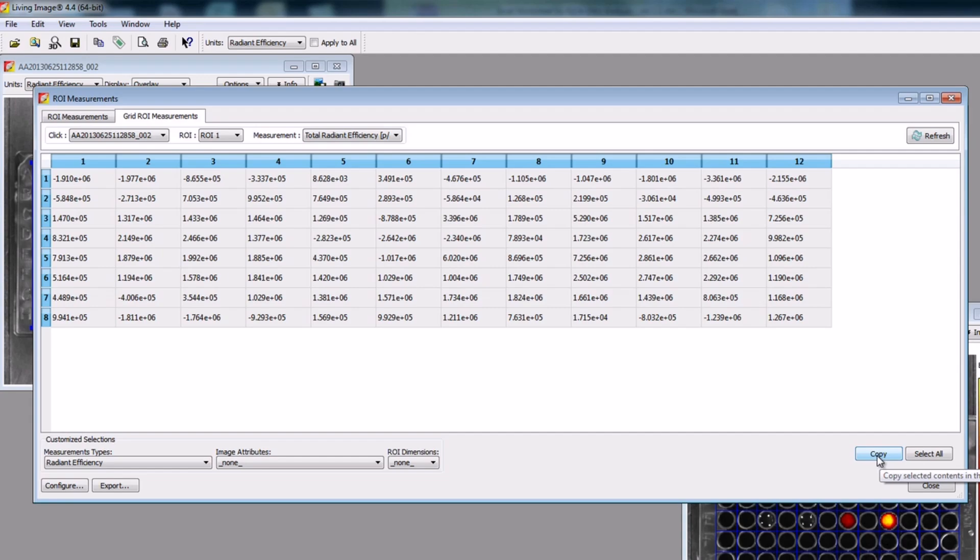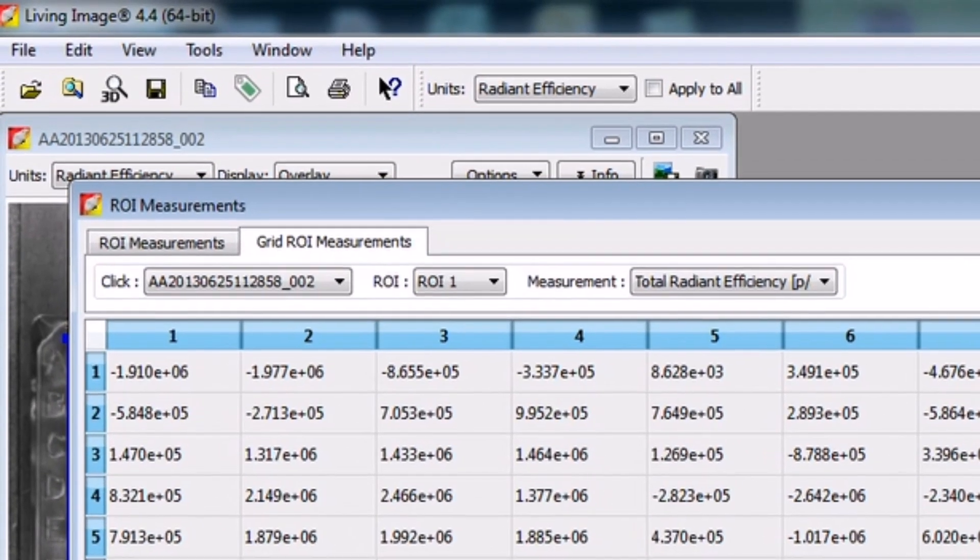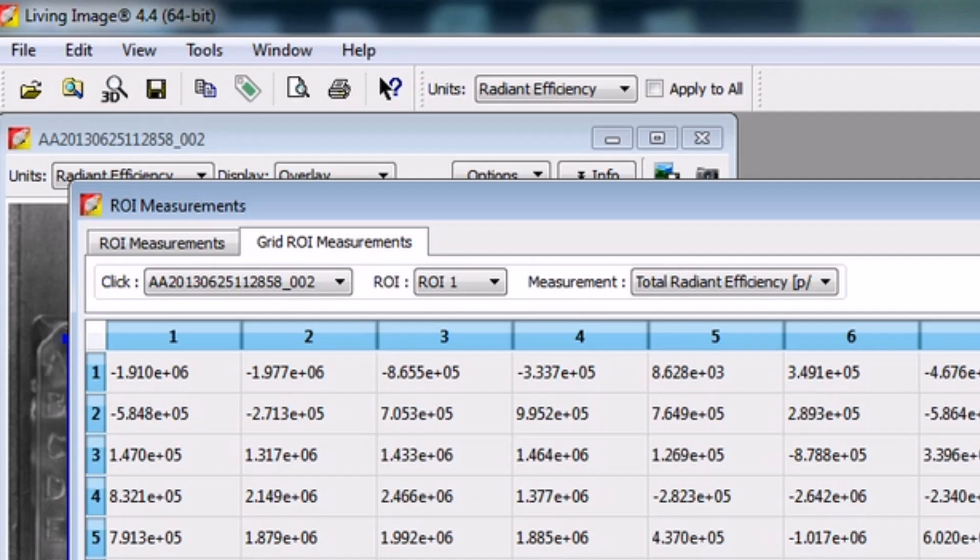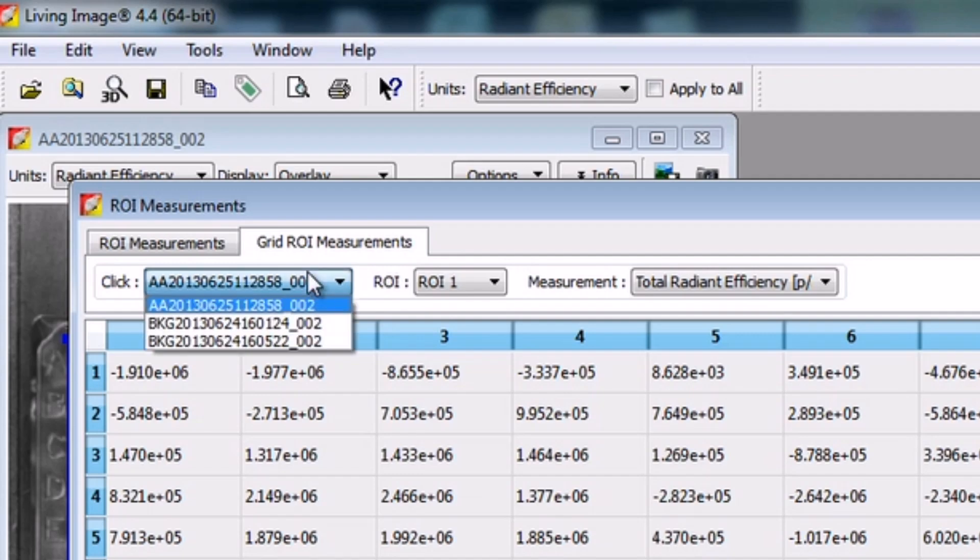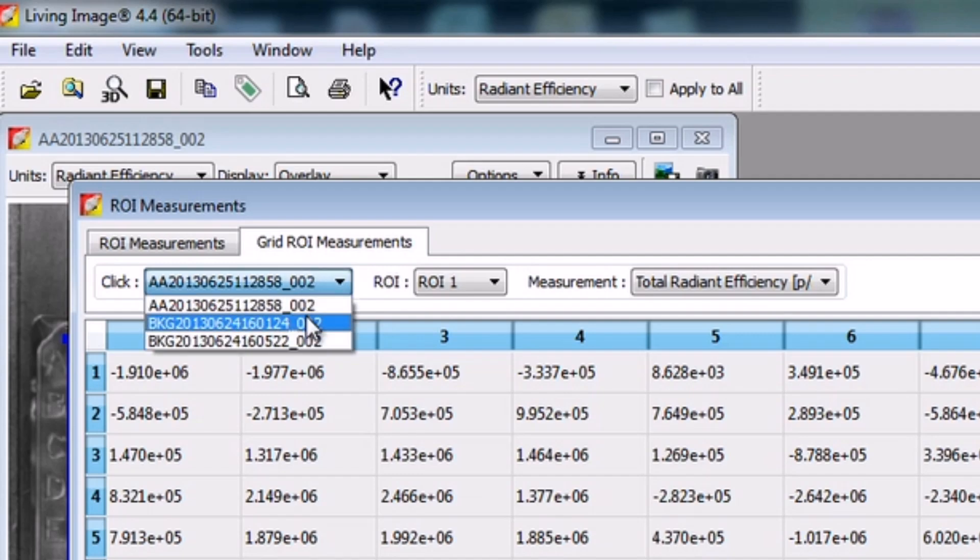Repeat this for each of your plates. You can switch between the different images or clicks by navigating to the upper left-hand drop-down menu labeled Click. The well plate images are named by the user initials and the date and time the image was acquired.